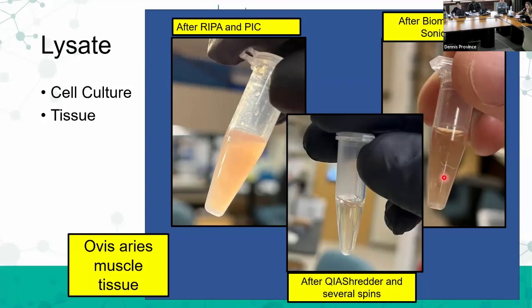That's something that we spend a lot of time on. It's one of those steps in the process that, boy, we'd love for all of you to just send us the lysates and do the protein quants for us, and we could believe those, and all we have to do is start our standard workflow. It'd be a lot easier, but we probably spend, I don't know how much time in man hours per sample, but a lot, because that is the secret of doing good proteomics: the sample prep. Not to downplay the mass spectrometry or the bioinformatics, but you're just making my job easier. That's exactly right.